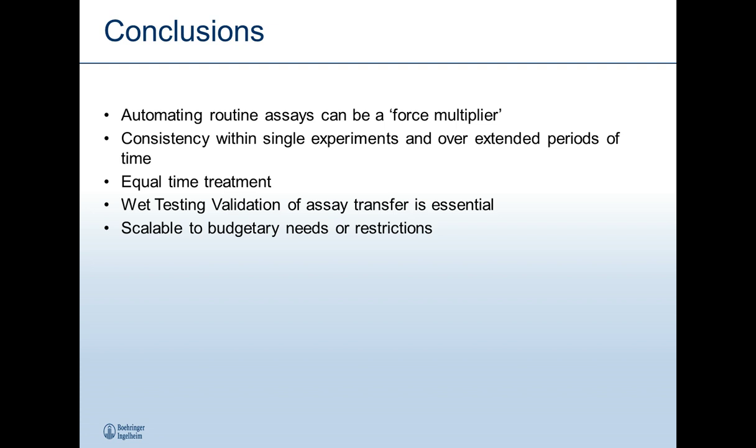Consistency within single experiments and over extended periods of time is one of the greatest benefits for instituting automation of different assay types. As I've said, equal time treatment can allow you to directly and safely compare samples across a wide range of time. Wet testing validation of an assay is essential and critical.